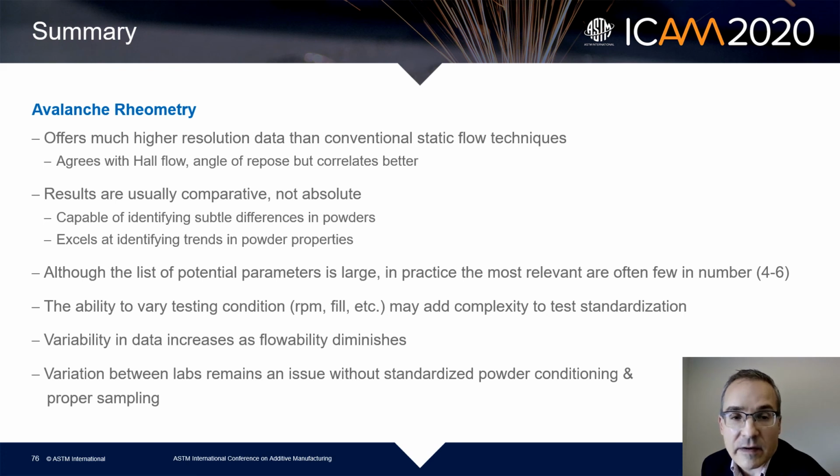And as you just saw, the variability in the data increases as the flowability diminishes, not unlike other techniques. And as long as we have a lack of standardization within the powder sampling and conditioning, there's going to remain this variation from lab to lab. So that's something that needs to continue to be addressed within F42.